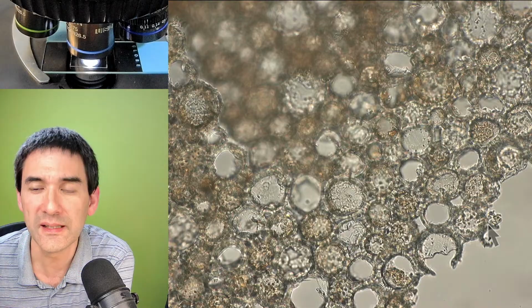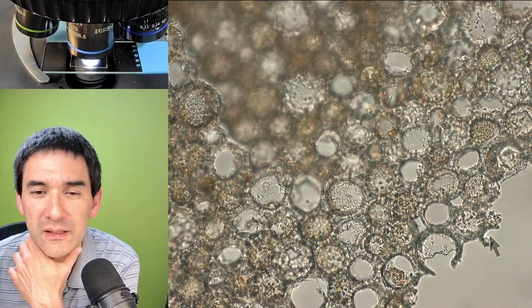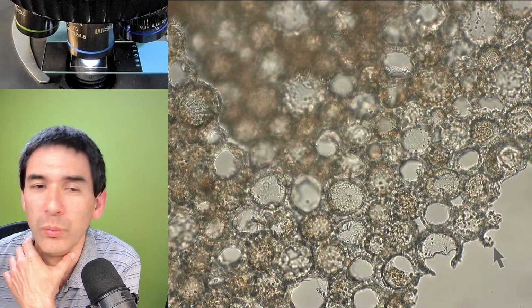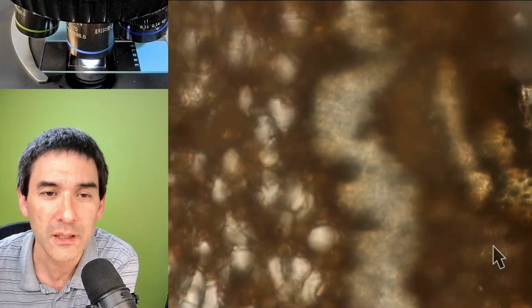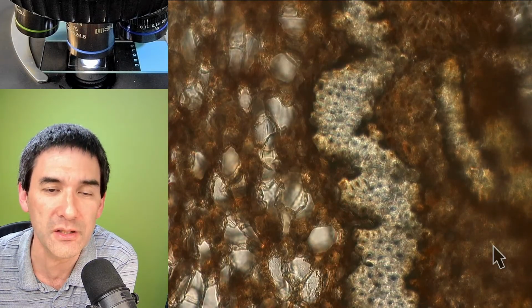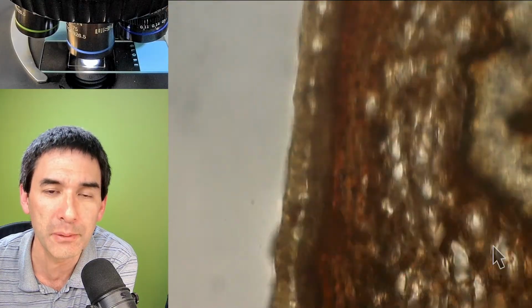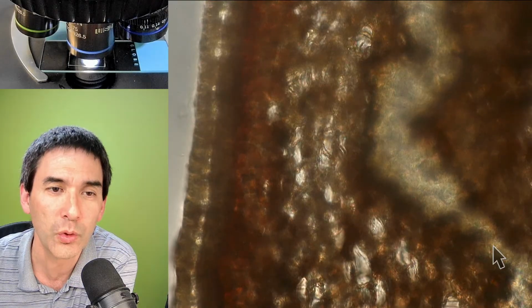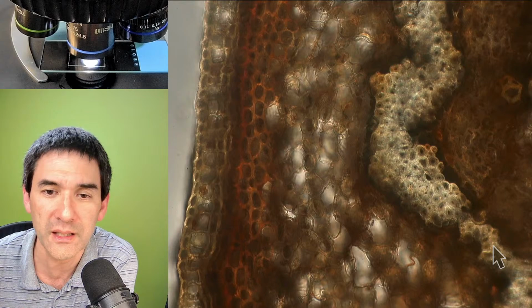Does looking at this slide show us what makes oak hard? Well, maybe not by looking at this slide, but wood generally is hard because of a chemical called lignin. And it's actually the lignin that is the chemical that makes up wood. And if we look at woody plants like this one over here, what we can see is that the cell walls are phenomenally thick.